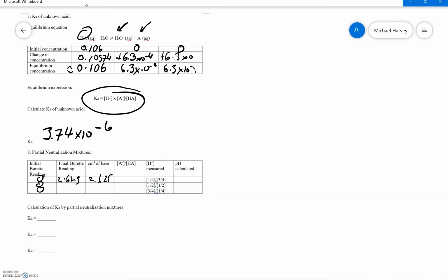The next reading was 5.250, and that was also 5.250. And the final reading, because I have to write really small, is 7.875 and 7.875. So I'll be using these numbers. Obviously, you will be using different numbers to calculate the asserted values for yourself.